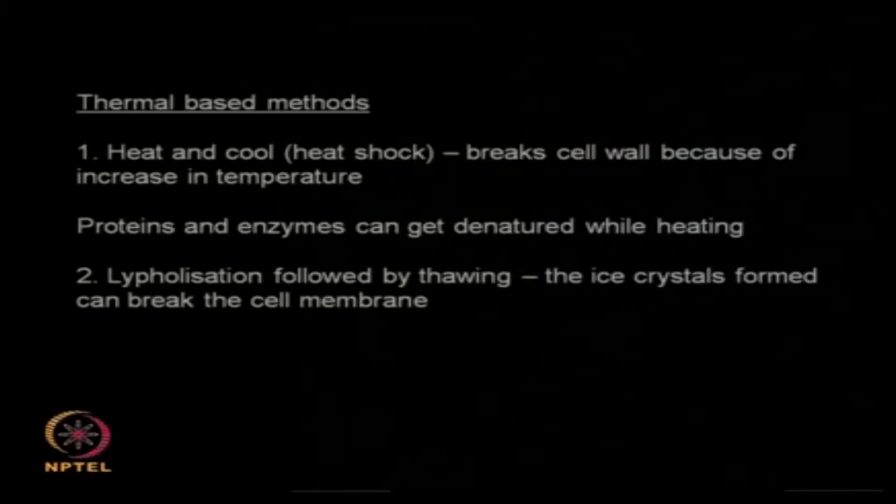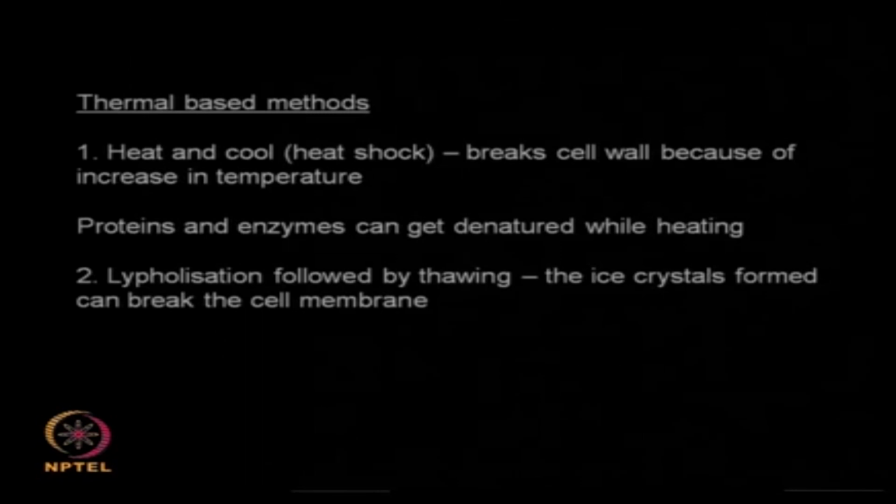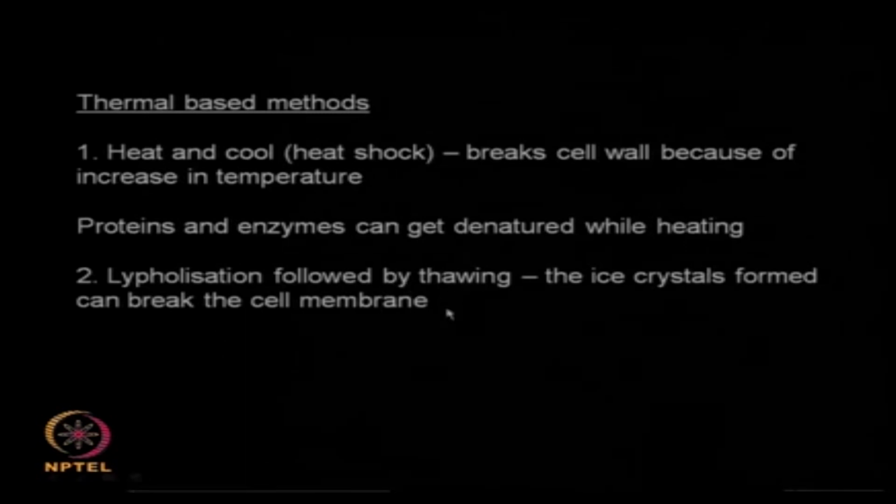Another method is lyophilization followed by thawing, that means you cool it and then again bring it back using thawing. The ice crystals that are formed can break the cell membrane. So this is also a good method. You completely cool it, solidify it and again bring it back to the normal condition. In that process the ice that is formed can really break the cell walls.